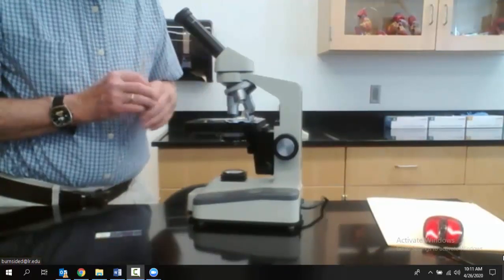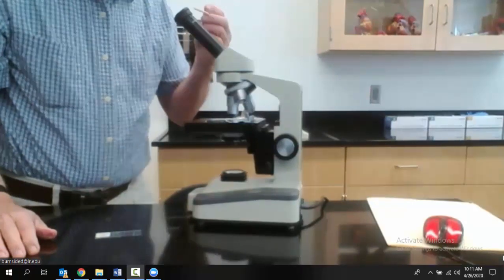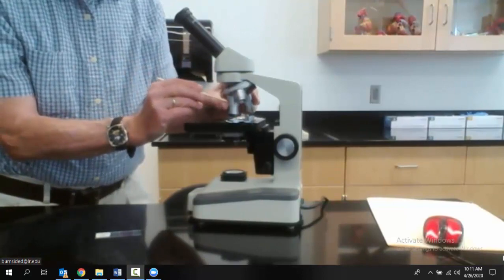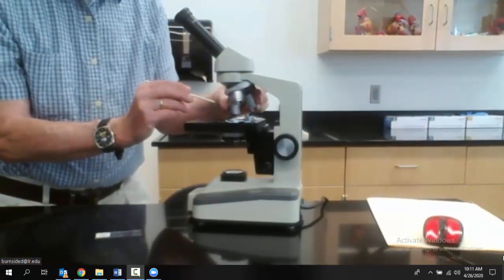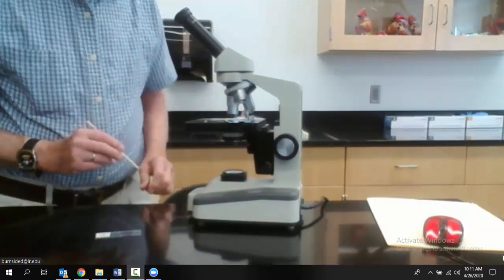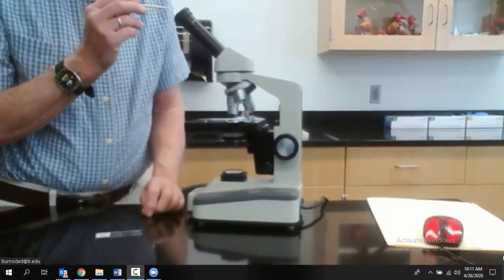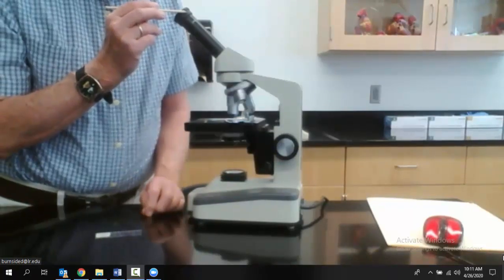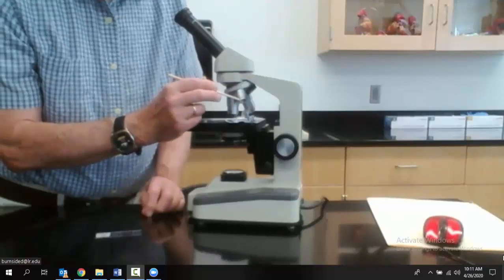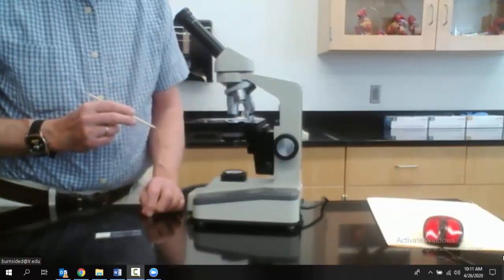The parts of the microscope: you have this part, which is called the ocular lens, and then down here on a revolving thing we have a series of objective lenses that give different magnifications. The magnification is the magnification of the ocular multiplied by the magnification of the objective lens.